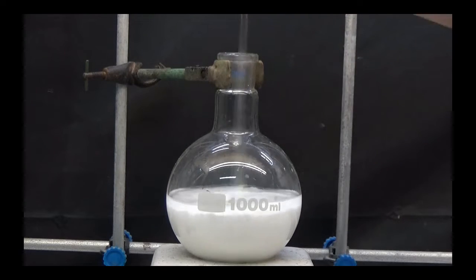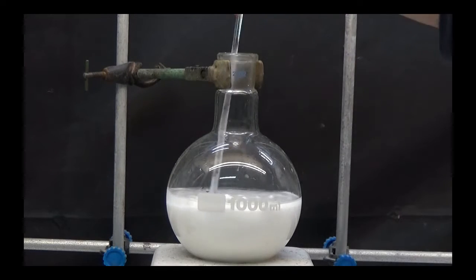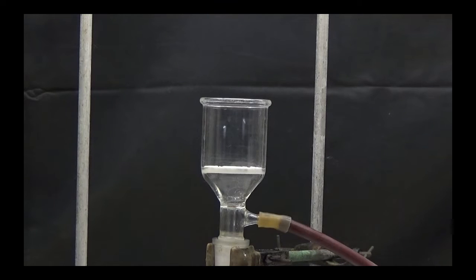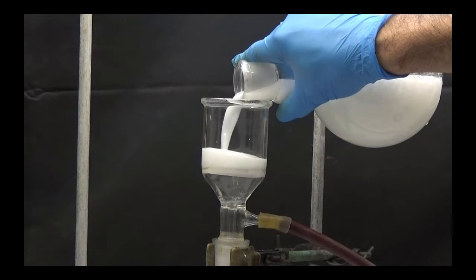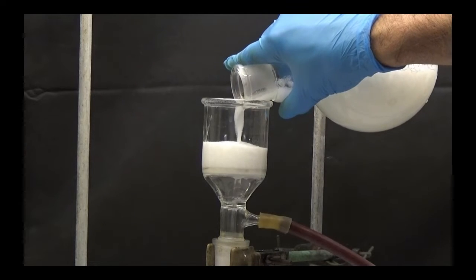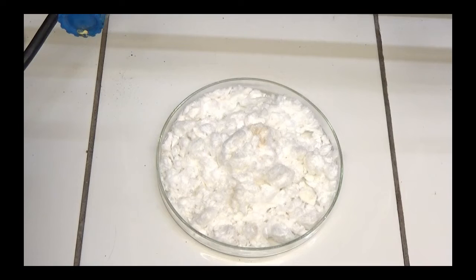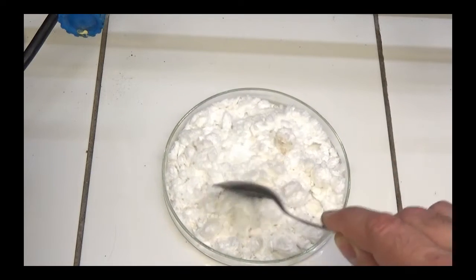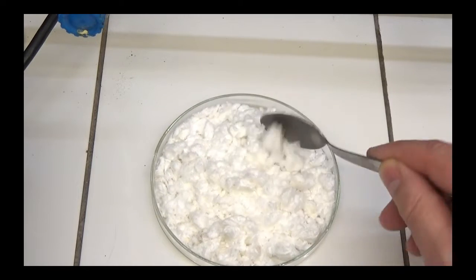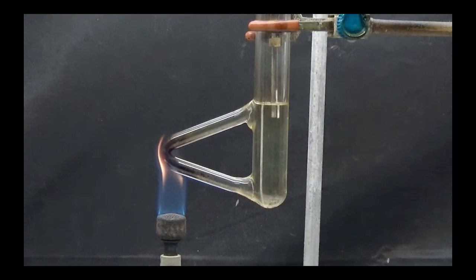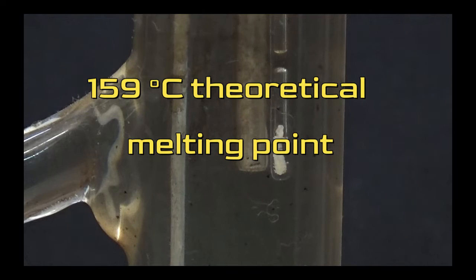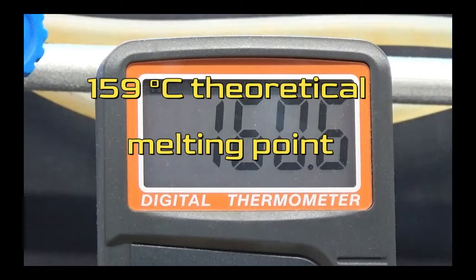100ml of additional water was added to disperse and collect the solid through suction. Dry in the oven at between 50 and 80 degrees. We determine the purity by determining the melting point, which must be 159 degrees.